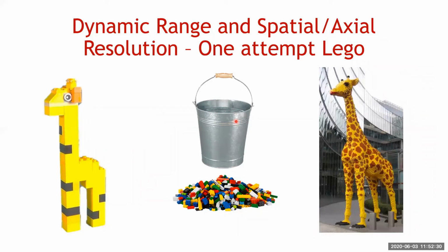Now, I don't know if that analogy works for everybody, but to me, it just means spend a little bit more time on the scope, get the best resolution you can, and you won't regret it. And the image analysis won't look like garbage, or you'll get something that's actually useful instead of having to go back and re-image your samples.